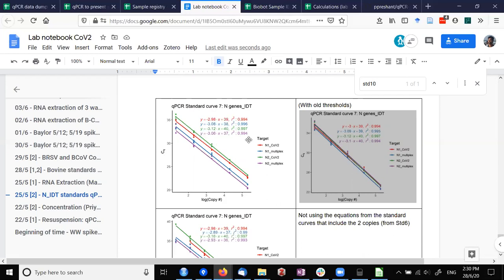So it just has that in a kit. So you have to add in your DNA thing, and then you have to kill the DNA by adding a DNA killing enzyme, DNase, and then you have to purify it. So that's another hassle that we have to go through, and I don't know how long this RNA is stable for. So that's another thing. So there's added things that you have to do if you're starting with RNA. And to buy RNA is a lot more expensive. I think somebody sells these N1 and N2 standards for the RNA. But I hear that they're really expensive.